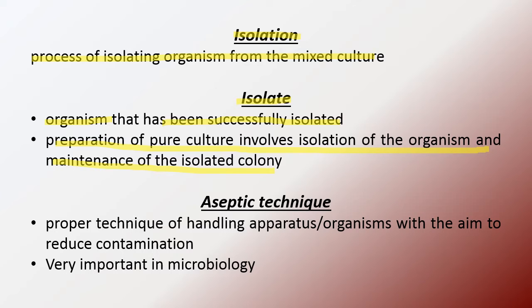On the other hand, the technique we need to know when it comes to isolation is the aseptic technique. Aseptic technique is the proper technique of handling apparatus and organisms with the aim of reducing contamination, and is a very important technique in microbiology, which you will also learn in your practical one.